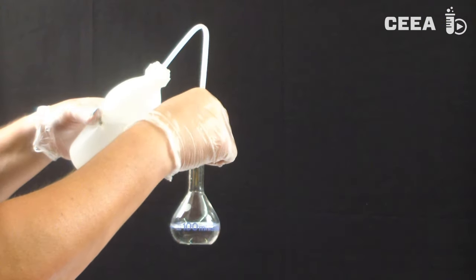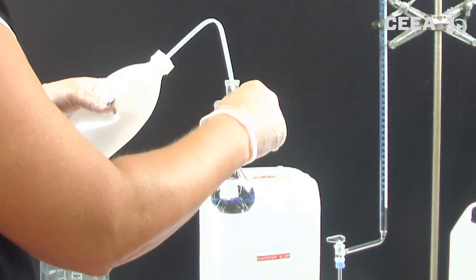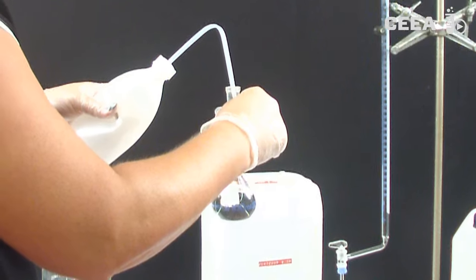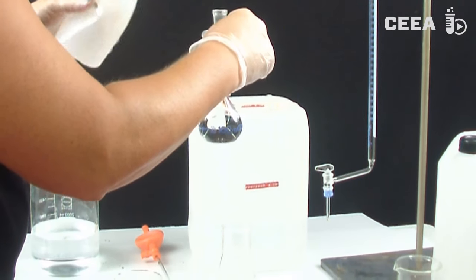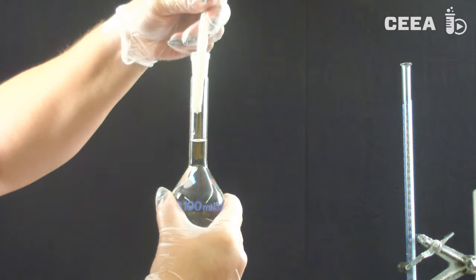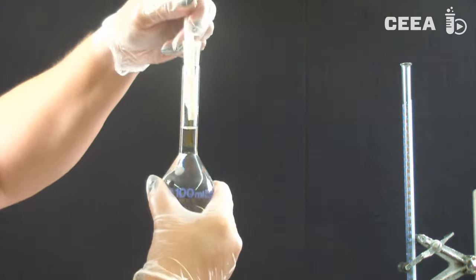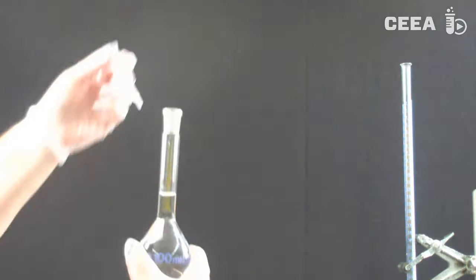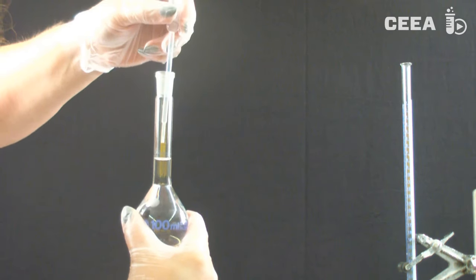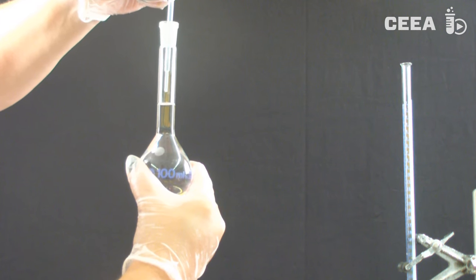Finally, the sample in the volumetric flask has to be diluted by addition of demineralized water. We carefully add the final drops until the lowest point of the meniscus reaches the mark.